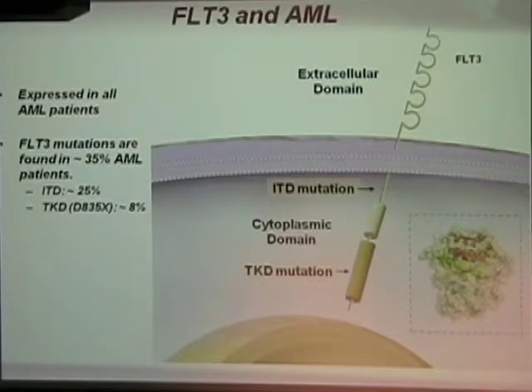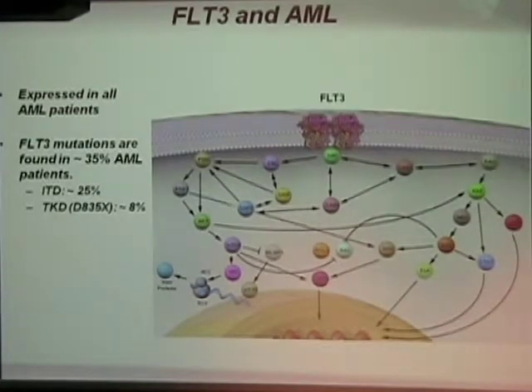We're going to be looking at the wild type without ligand, the wild type with ligand, and then 2 mutations that cause constitutive activation and are clinically relevant to this signaling cascade. One of them is called the ITD mutation, and the other one is a point mutation called D835Y. They have a clinical impact, and so we would like to study the differences in how they affect the signaling cascades. Okay, and we're going to try and get as many phosphosites as we can, again, looking at phosphotyrosines.